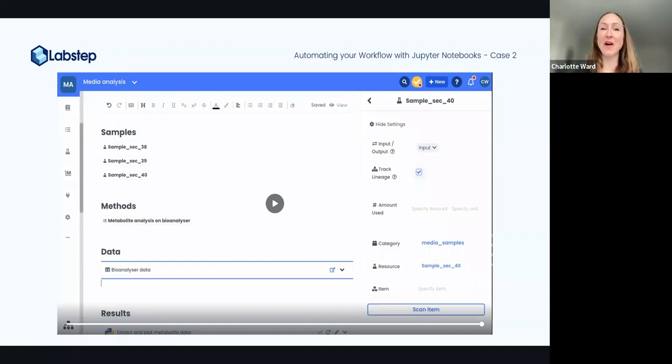Oh yeah, a couple of good questions. So how much do you need to know? I mean, you can go on learning forever. You definitely only need a little bit to get started and start doing the first things with it. What's really nice is Python is a very commonly used and very standard language within sciences. There's an awful lot of resources out there for learning to use Python. The scripts that you write in Jupyter Notebooks are very standard. It's just normal Python.